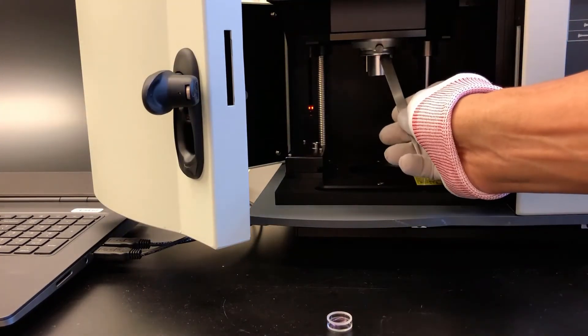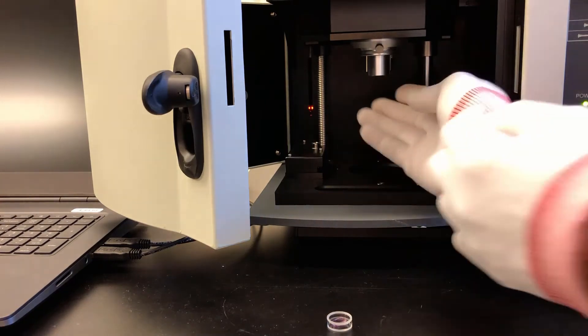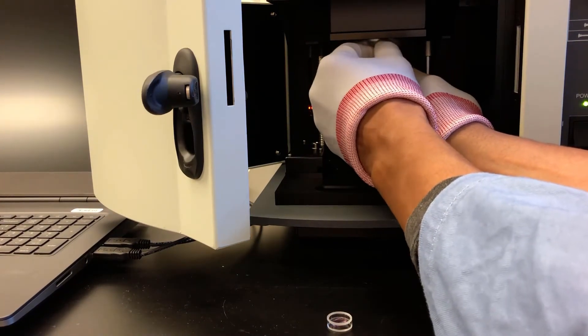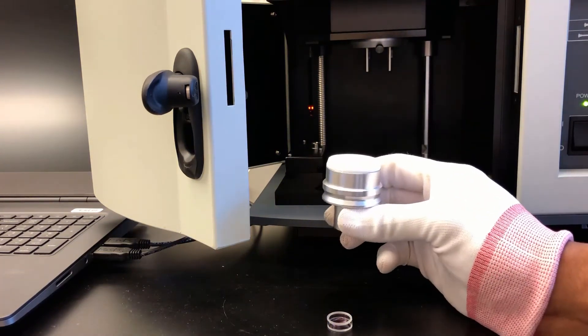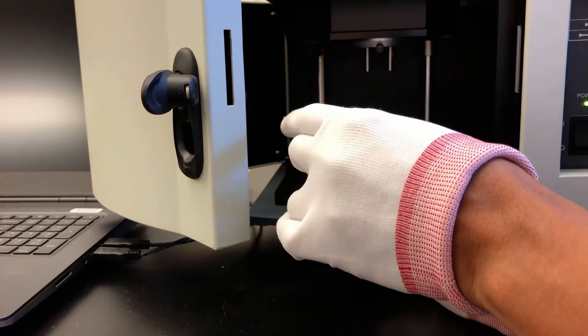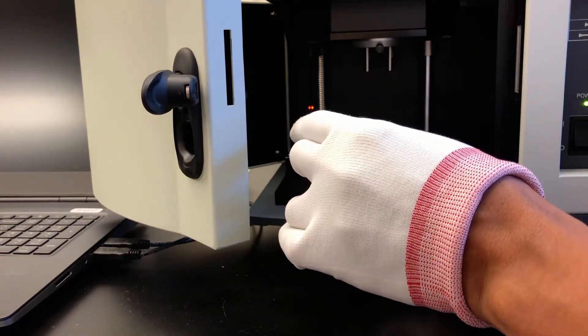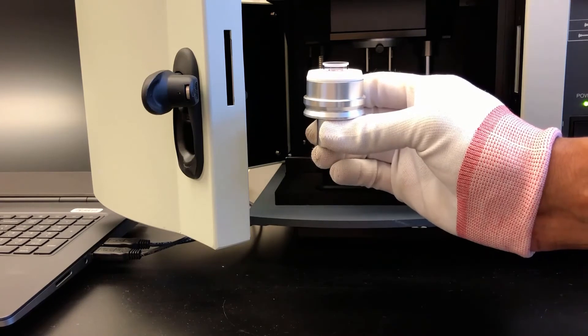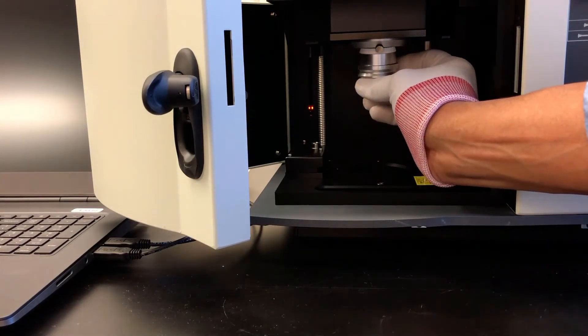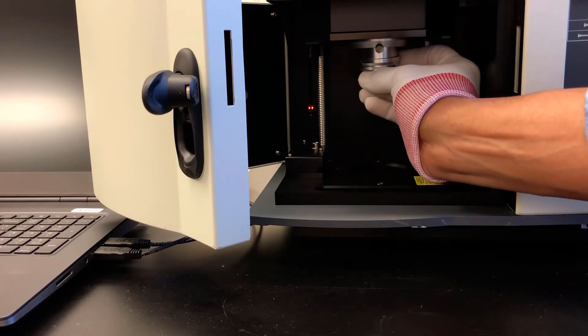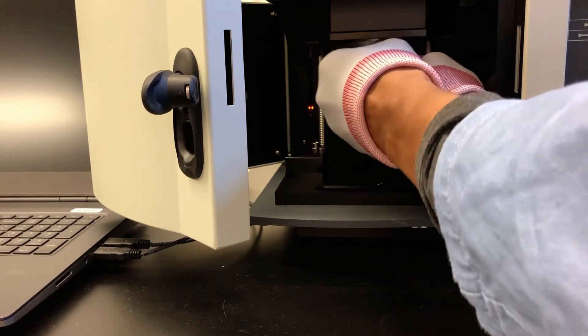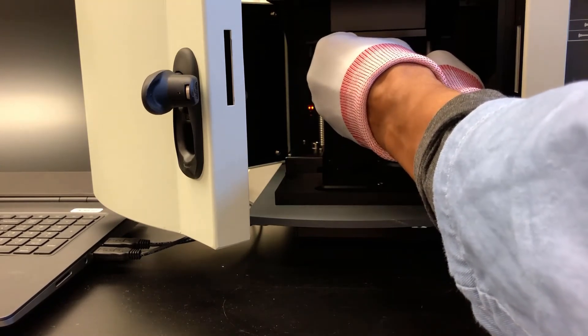You'll notice a screw holding a reflective plate in the integrating sphere. Let's remove that to put our sample in place. Be sure to tighten the screw again so the plate is secure.